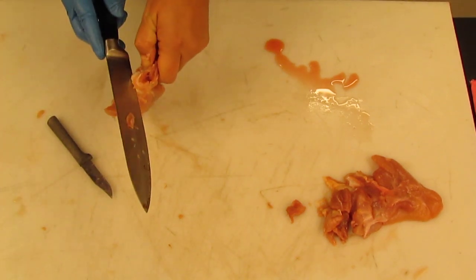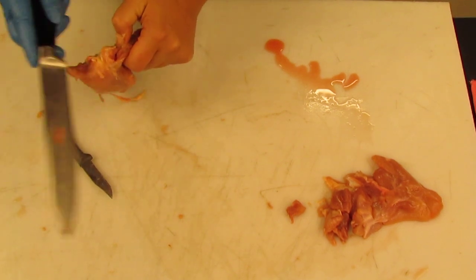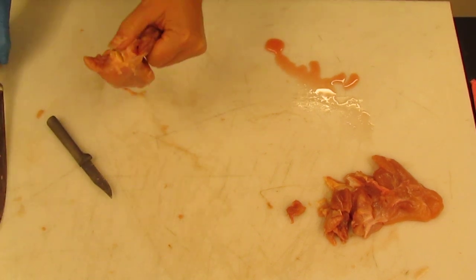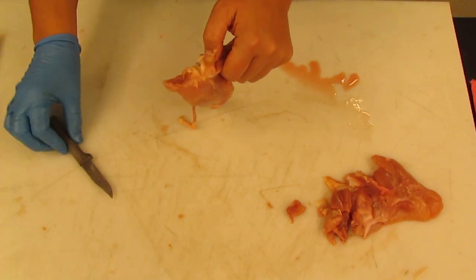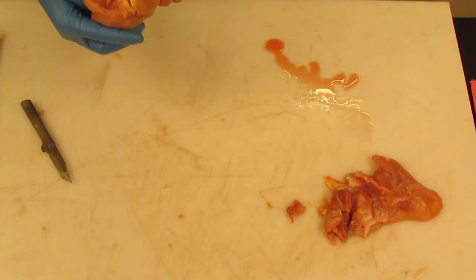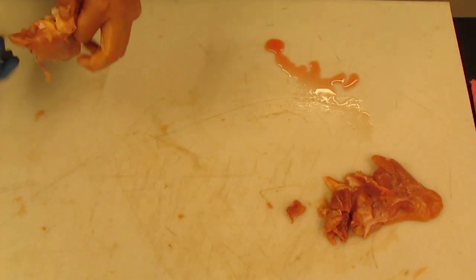Okay, I can't quite see the ACL just yet, so I'm going to cut through a little bit more of this joint capsule. It's a little bit fatty. Nice gentle movements so that we don't just cut through the entire thing. All right, so now we're starting to be able to see a lot more of this connective tissue inside.